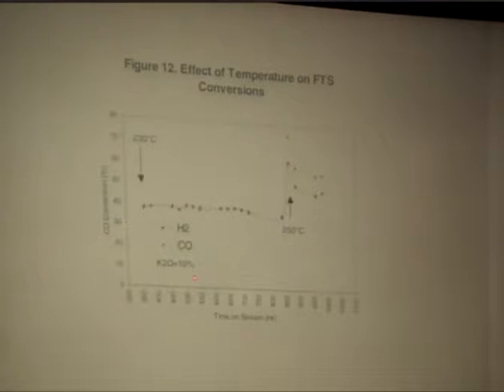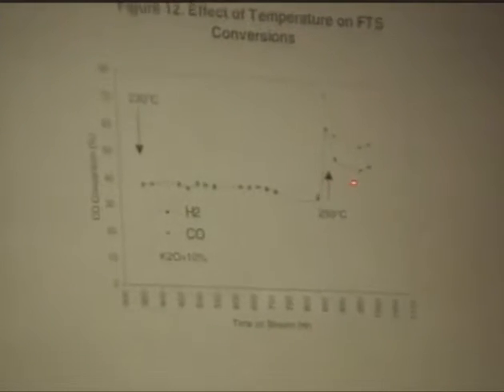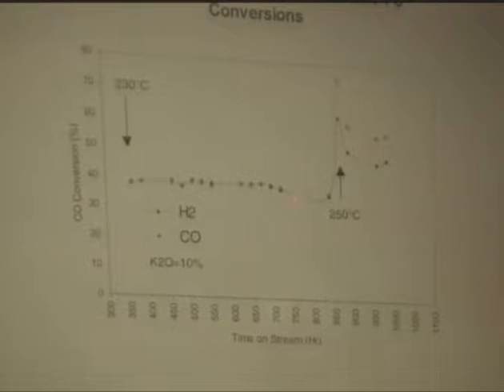This one shows the temperature jump from 230 to 250. It shows you that a 20-degree temperature increase results in a new induction period. It jumps, for example, the H2 conversion from like 38% to 48%, and the CO conversion from 30% to almost 52% here.